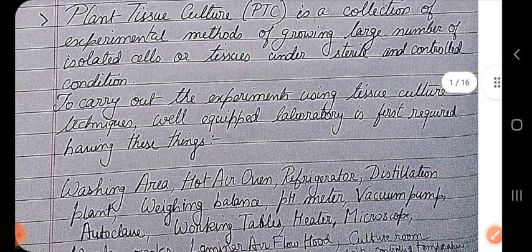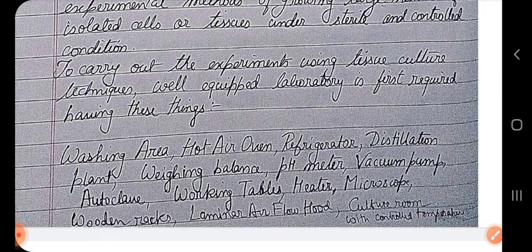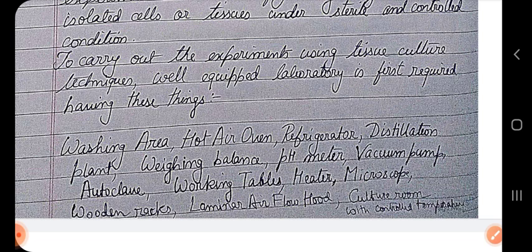Like you need a washing area, a separate room for washing, a hot air oven where within a certain temperature you will dry all the things that need to be used for tissue culture. A refrigerator for storing the sensitive chemicals which can get damaged at normal temperature. Distillation plants for the preparation of double distilled water, deionized water. Then a weighing balance, obviously for weighing the chemicals needed for preparation of the tissue culture media, the artificial media.